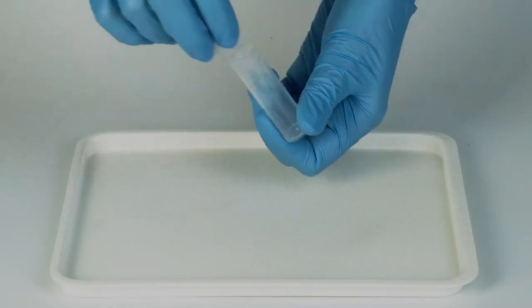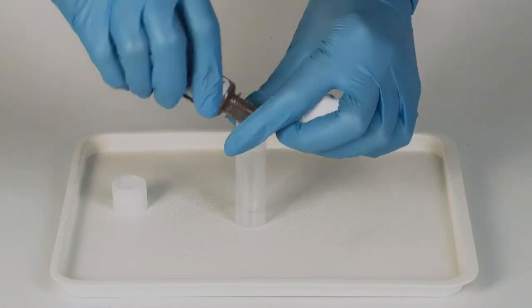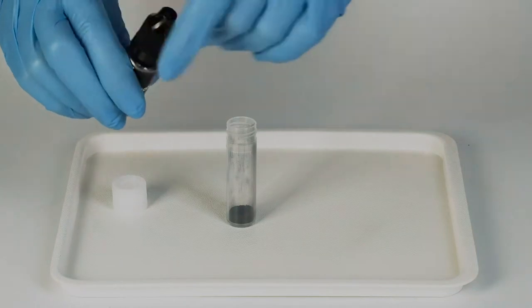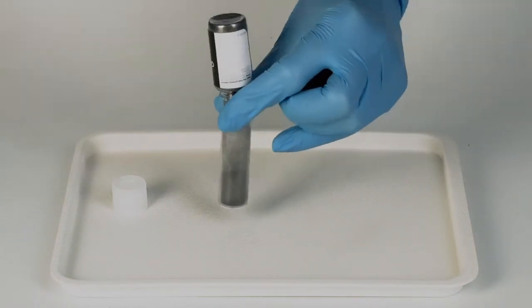Pour the entire bottle of manganese dioxide into the plastic vial, slightly tapping the sides of the bottle. Then add the entire bottle of graphite.